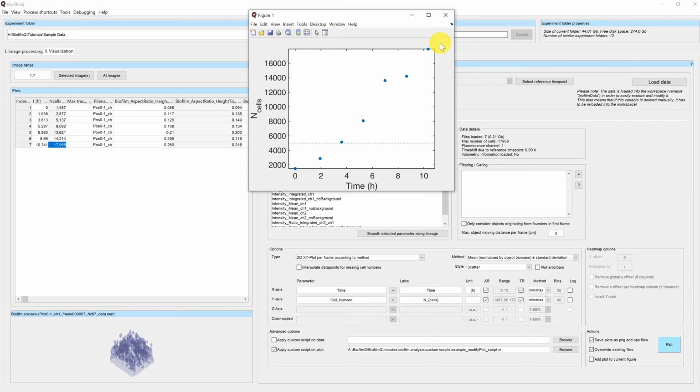Now for our second example, we will have a look at the data prior to plotting. What we will do here is shift the time point. You can see that my time point is every 2 hours roughly.